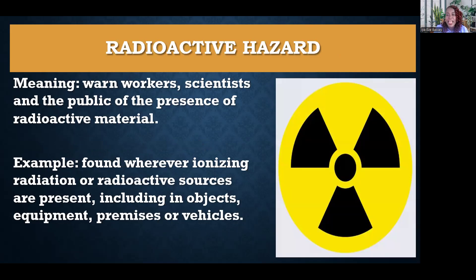This is the radioactive hazards symbol. Sometimes in the lab we do use radioactive substances, especially in clinical chemistry — for example when doing radioimmunoassays or working with radioisotopes. This sign means that those substances emit radioactive rays, which are known to cause cancer and other diseases. You find them wherever ionizing radiation or radioactive sources are present, including in objects, equipment, premises, or vehicles. So be very careful and be appropriately dressed before you enter such places.